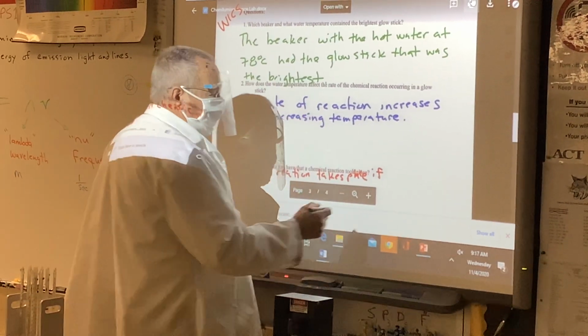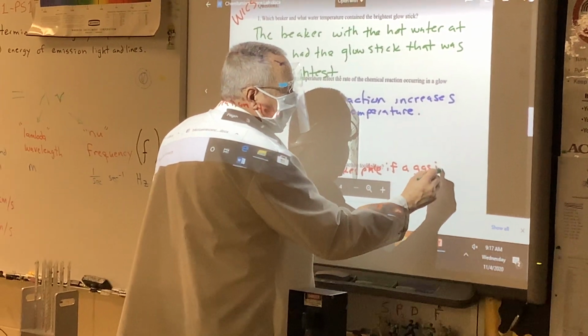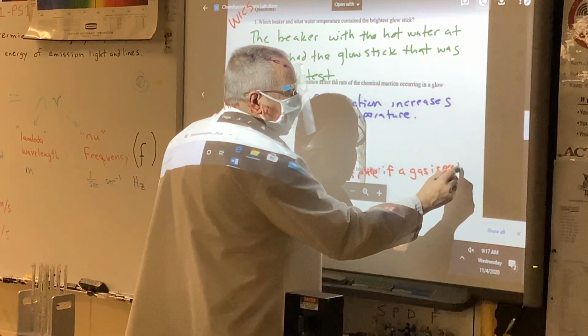One way is if a gas is produced, we look for little bubbles. That didn't happen.